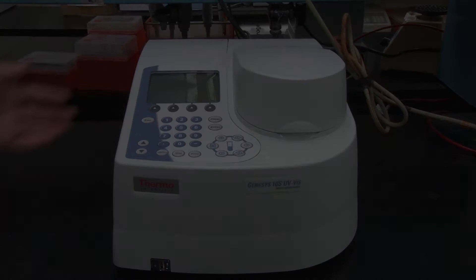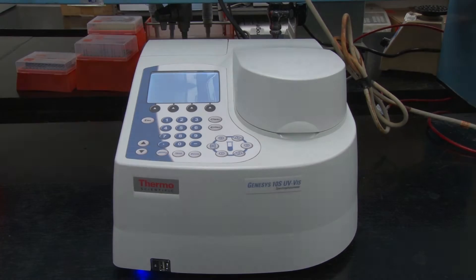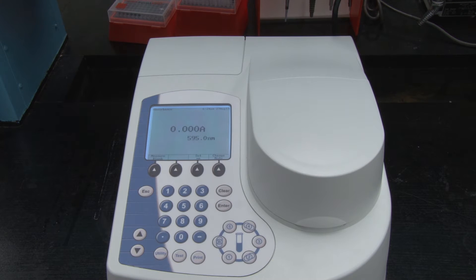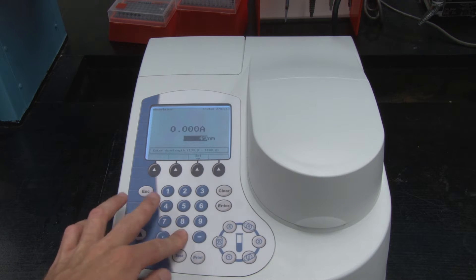This video will cover basic operation of a spectrophotometer. First, turn on the spectrophotometer by using the switch in the back. Set the wavelength to be measured along with other parameters using the settings on the screen.